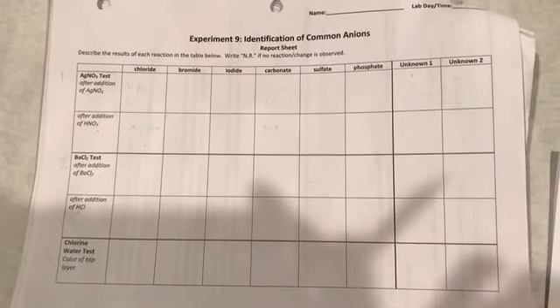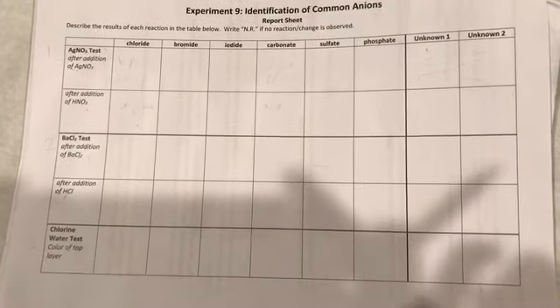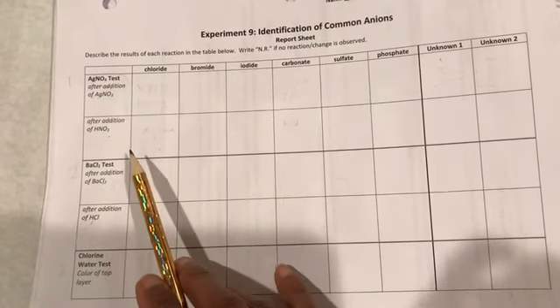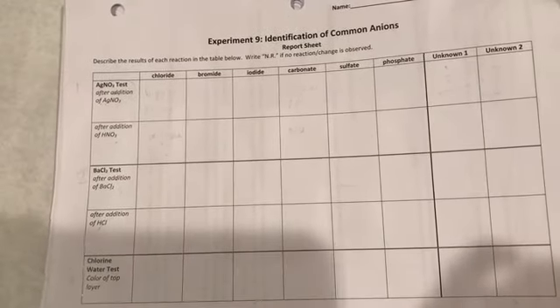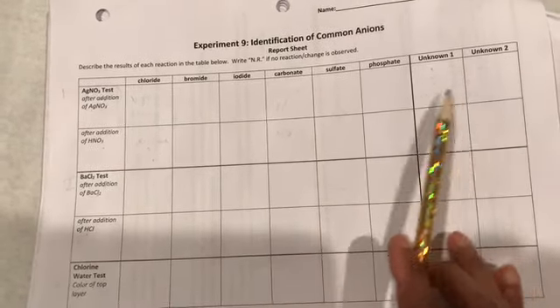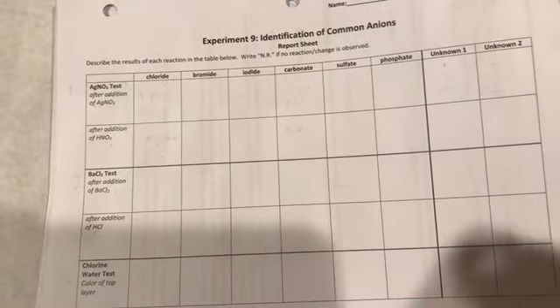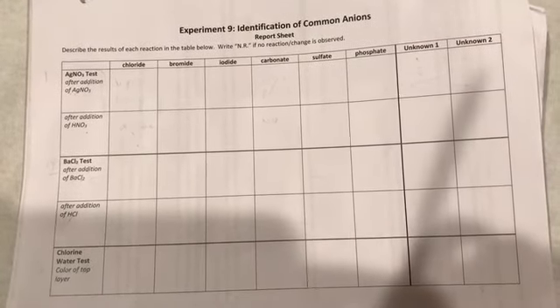Now where are you going to write or record your observations? Towards the end of this experiment, you would have the report sheet. There you can see that it is divided into 3 parts: silver nitrate test, barium chloride test and chlorine water test. And these are the 6 anions, and then you have 2 unknowns. So you are going to record the observations based on the chart we saw before.